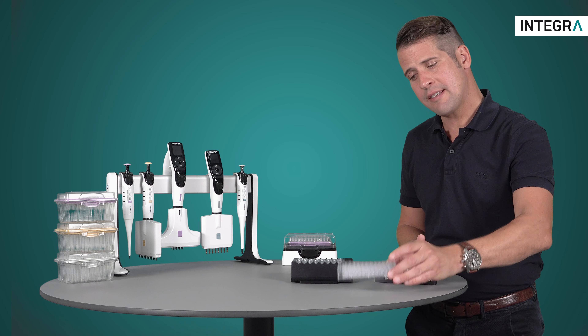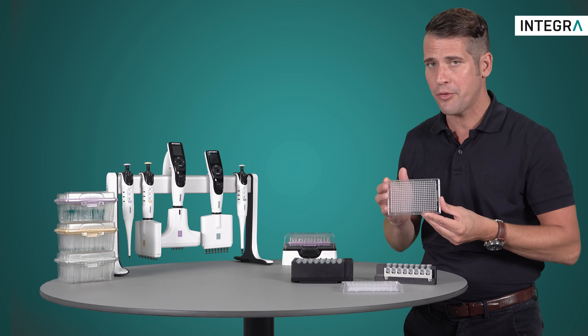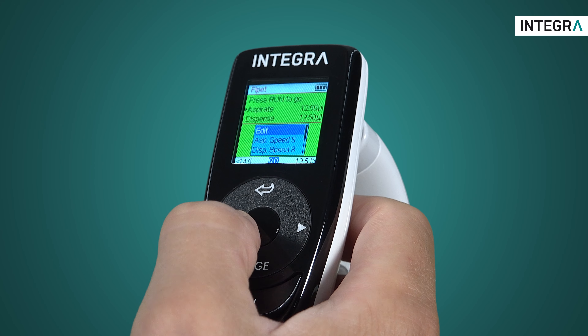96-well plates have a spacing of 9mm, while 384-well plates have a spacing of 4.5mm. Once the positions have been defined, you can enter any program from the main menu, and you'll see that your saved positions are on the bottom left and right.